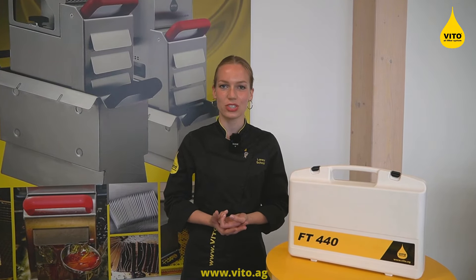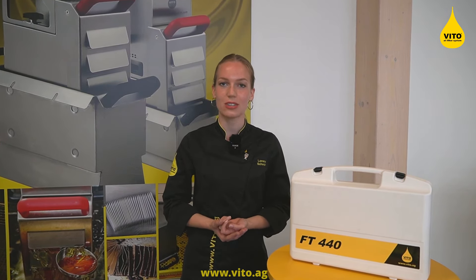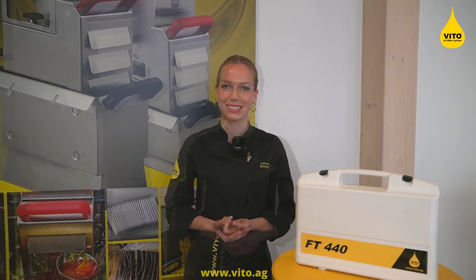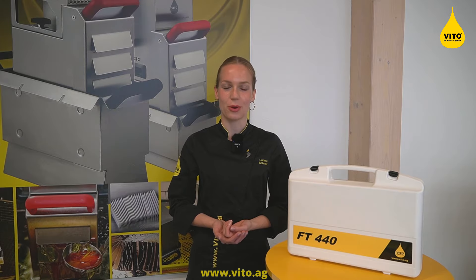The VFT440 is an efficient way to measure your oil quality. You can check how often the tester was used and also calibrate it once a year if needed. Please contact us for a quote or further information.